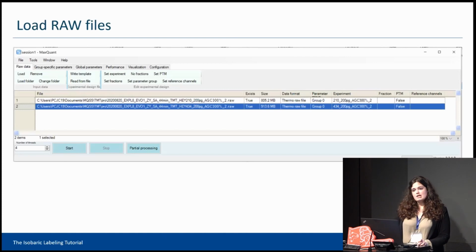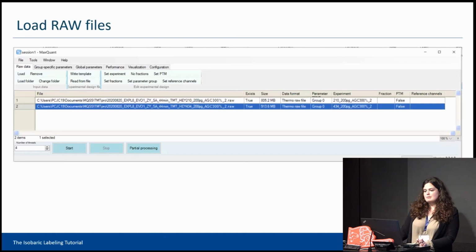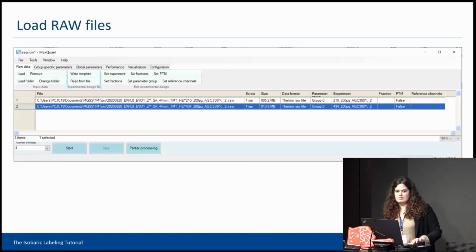What I usually suggest is, if they provide a metadata, which is already difficult sometimes to find, but if they provide it, please set the experiment in the same name labeled as it is in the metadata, so that whatever you did, it may be something wrong or not, you can go back and see what was not done properly. So that is just my personal suggestion based on my experience.